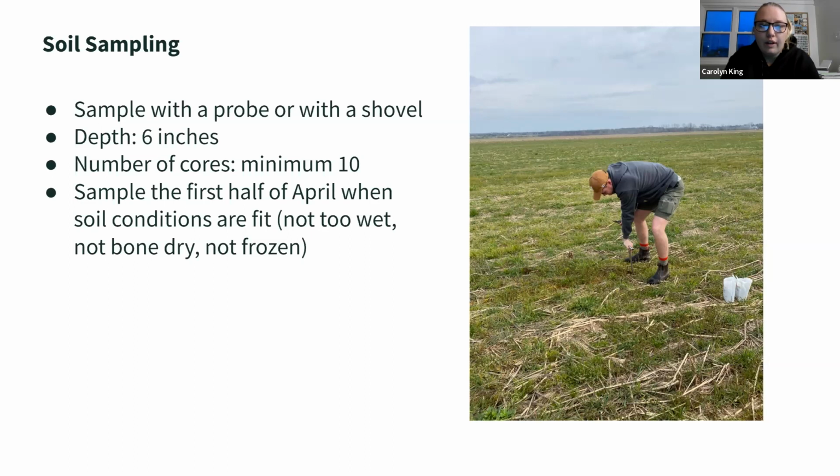You could do fewer there, but sample in the first half of April here, when the soil conditions are fit: not too wet, not too dry, definitely not frozen. Again, that's important because of the biological activity. So make sure you get it done in the beginning of April when things start to warm up.